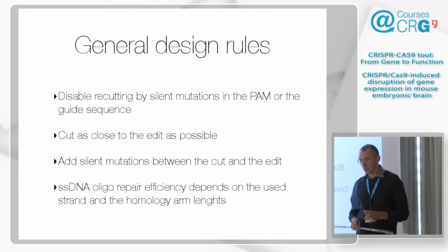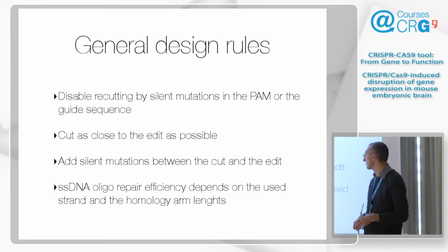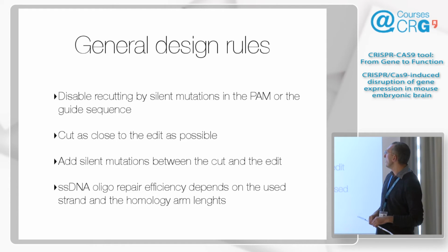So in terms of general rules, I think you've gone through a couple of rounds. I might be repetitive. I'm just not going to give the basics, just a few things that I find useful. So it is crucial to disable the recutting whenever possible. By disrupting the PAM, or if that's not possible, the guide sequence.